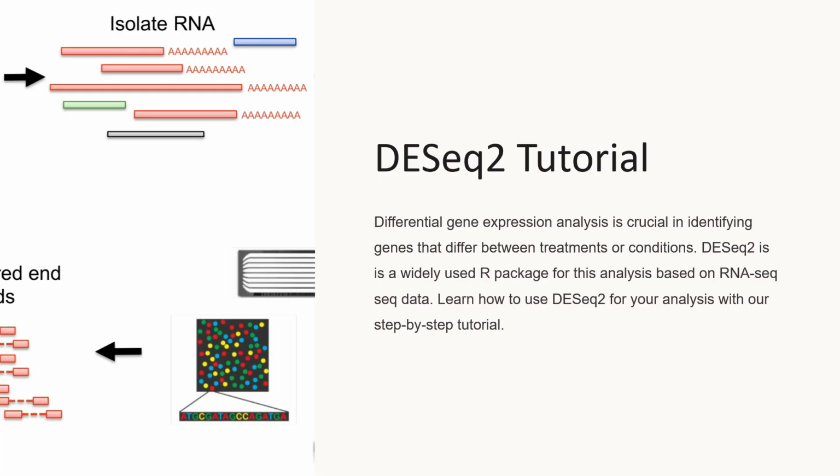When we do RNA-seq analysis, single cell analysis, or microarray data analysis, we get FPKM values, which are fragments per kilobase of exon based values. When we get the RNA sequencing data, we use this kind of data for our RNA based sequencing analysis. So what we do is we use the DESeq2 package, which is widely used for this RNA sequencing analysis.